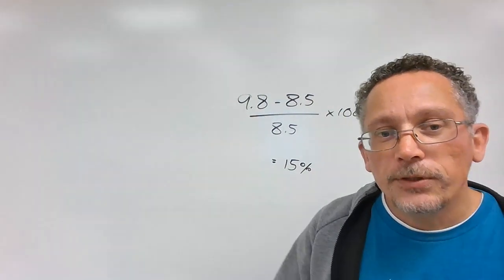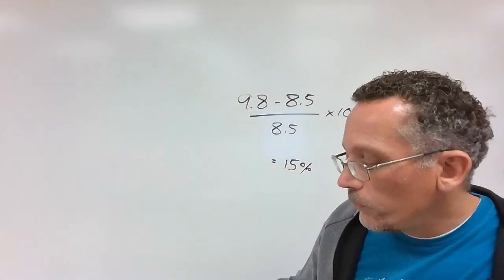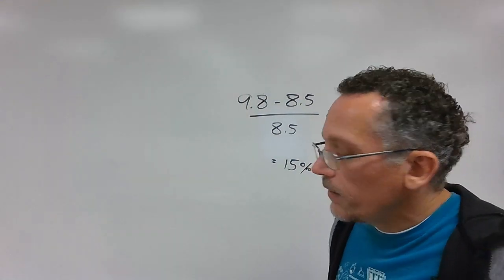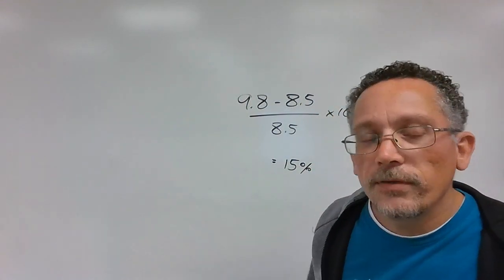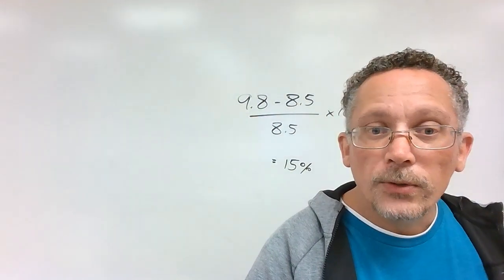And then number 9, optional. Density is calculated by dividing the mass by the volume, and then we could use that equation to find the density for each one of our data points. All right, so there are our post-lab questions.